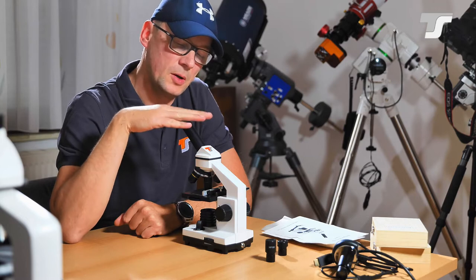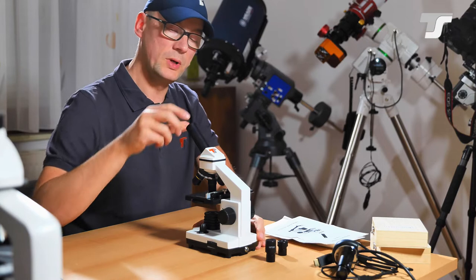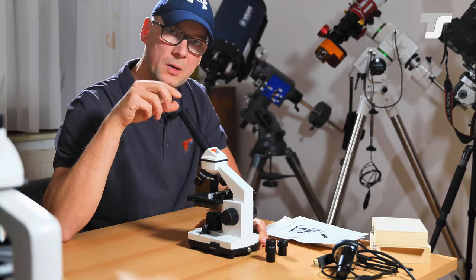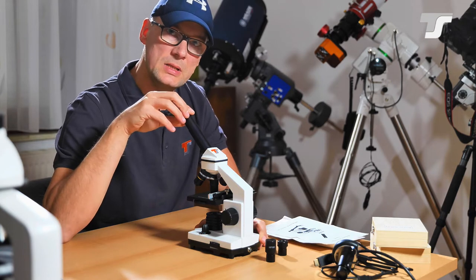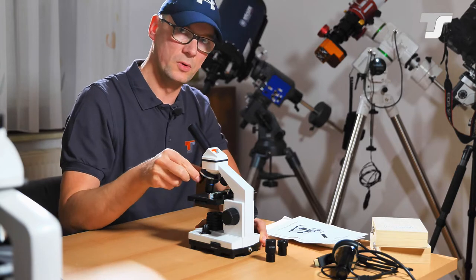Starting from the top going down to the bottom. So the first thing I already showed you is this drawer tube here. It's some sort of Barlow element that you can use to change the magnification in addition to rotating the revolver.